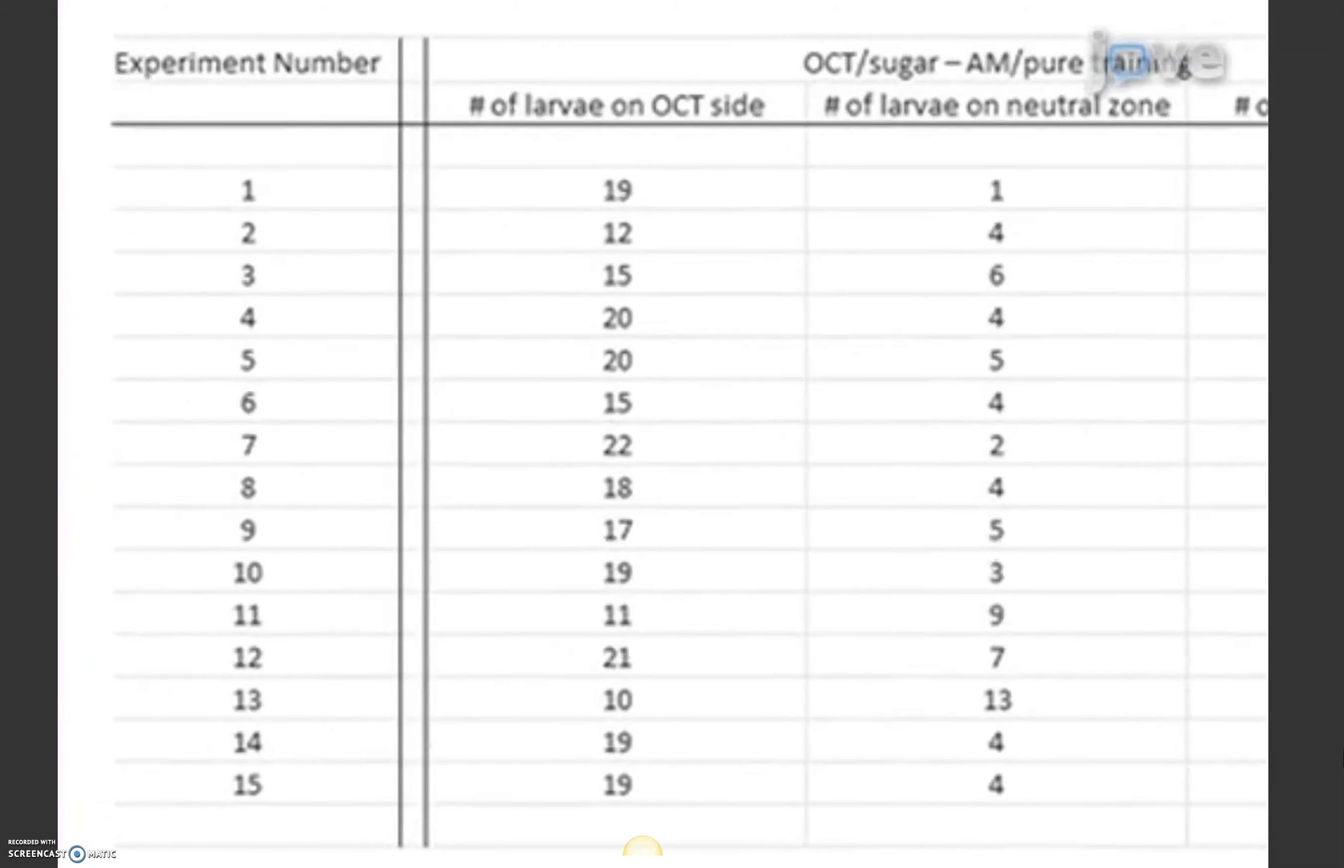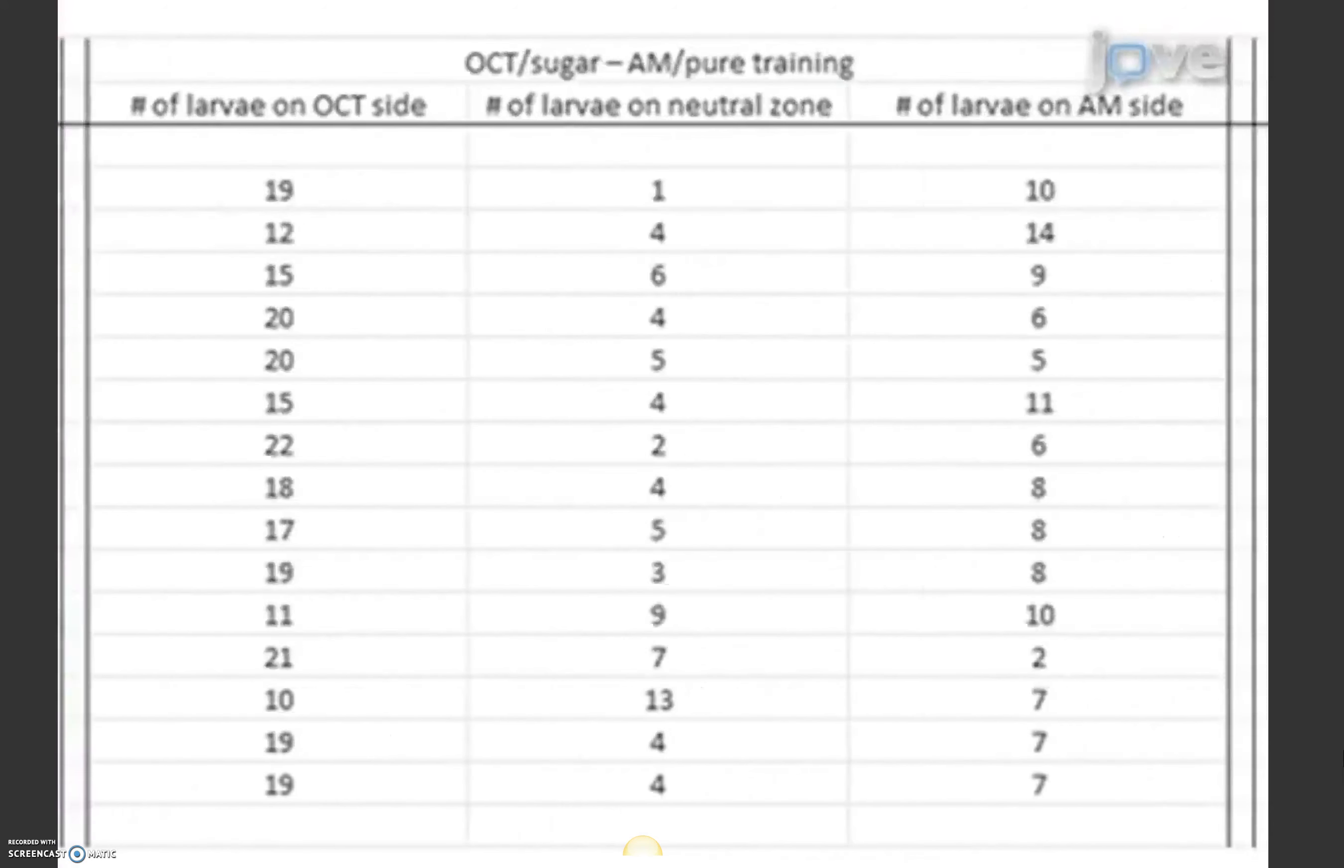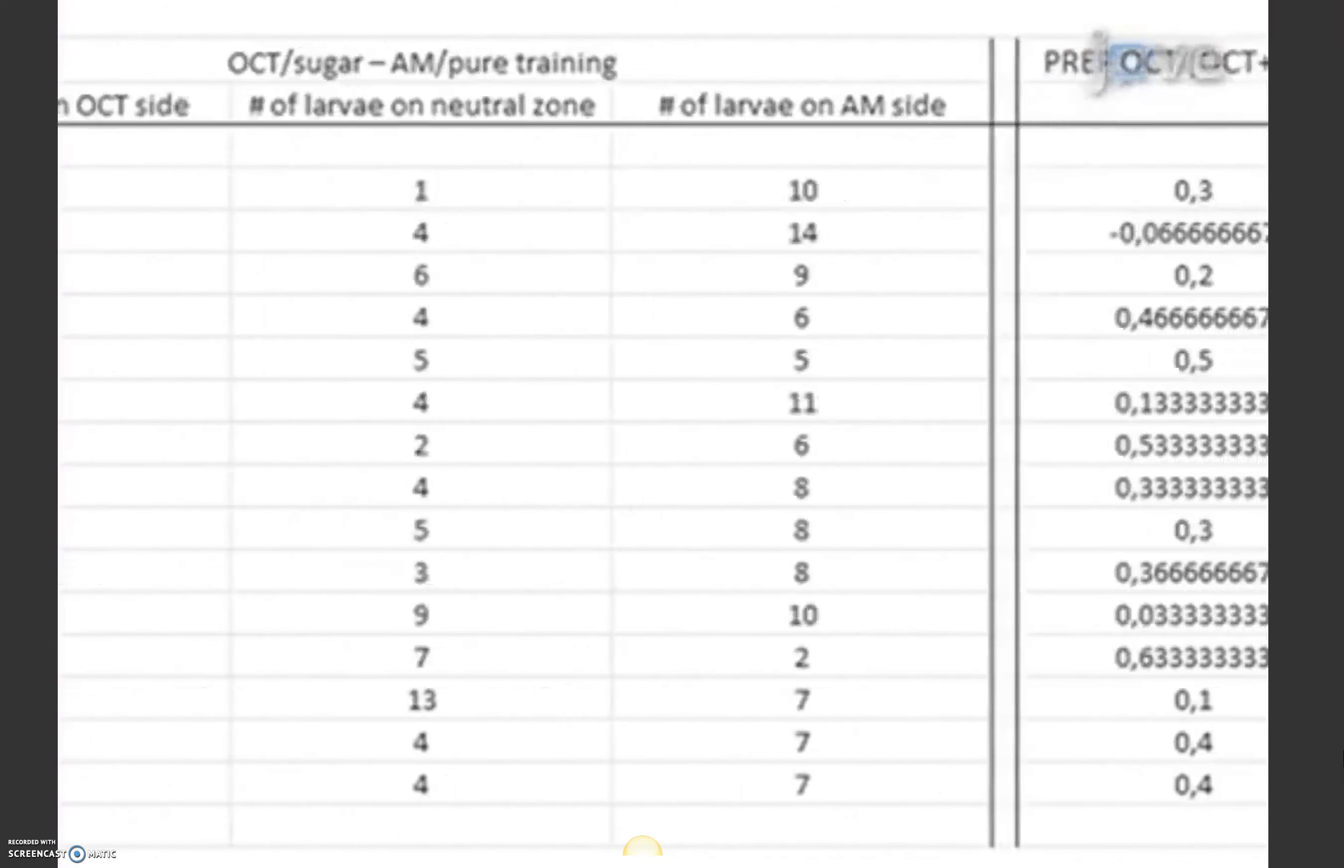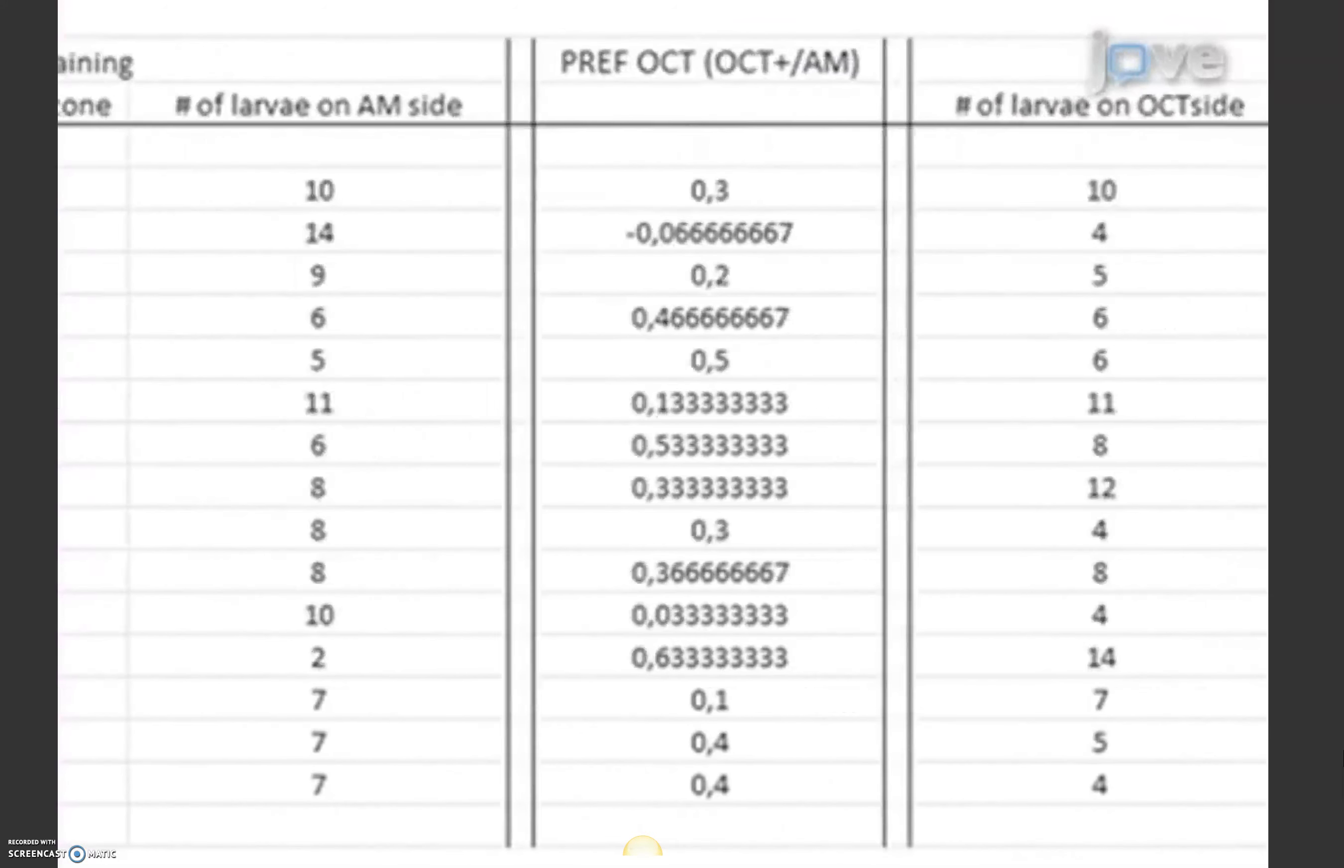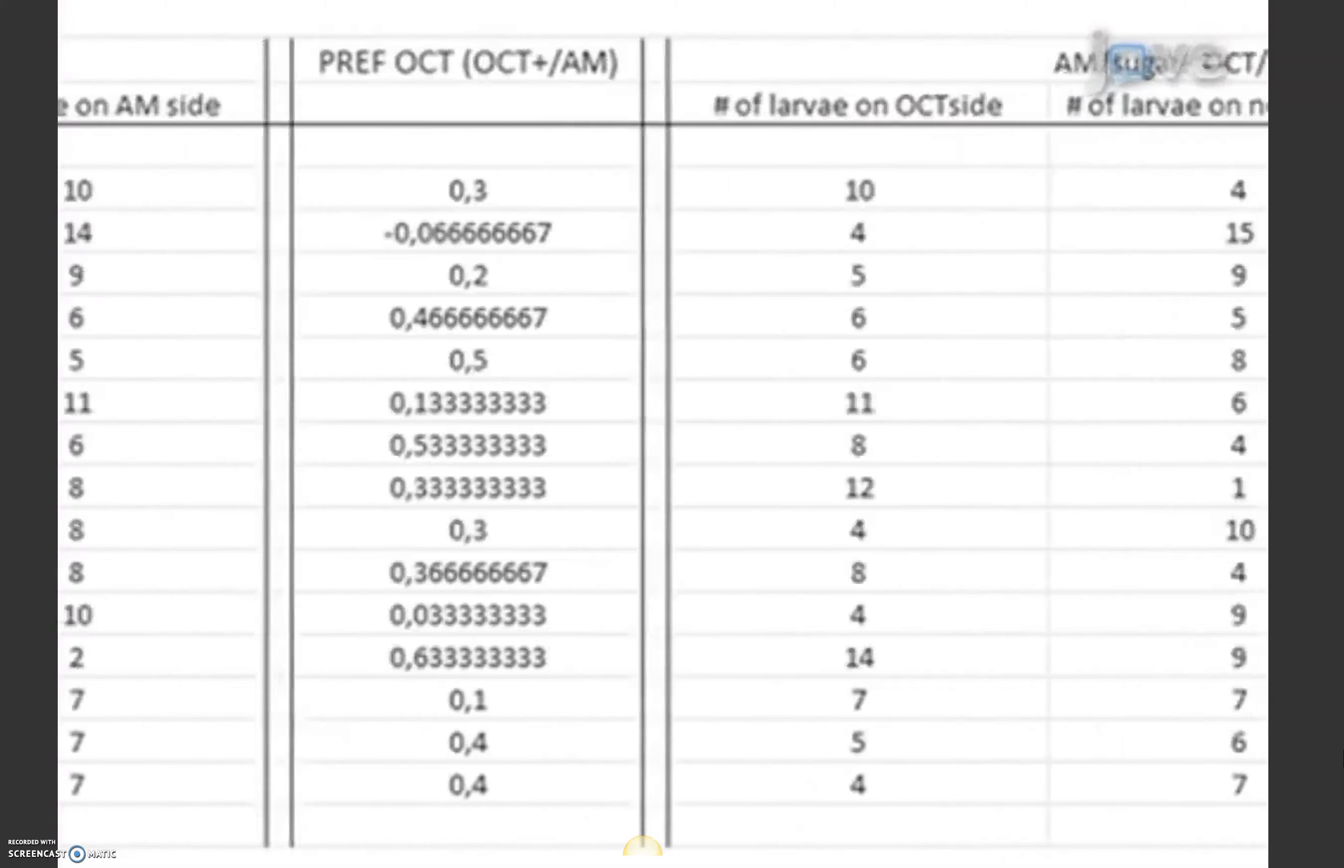The described procedure was used to train and test transgenic larvae. Using the example stimuli, data was tallied as the number of larvae in different regions of the petri dishes after 5 minutes.